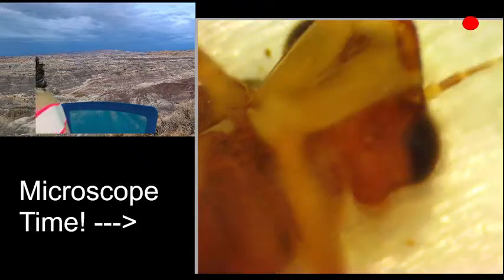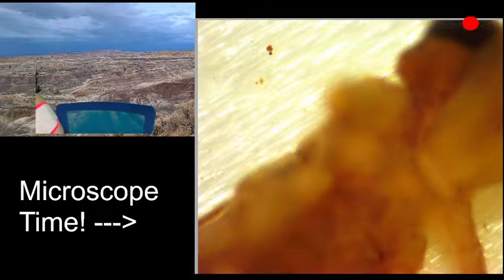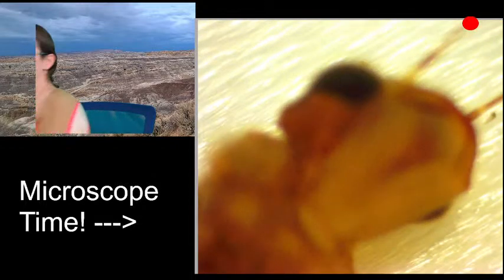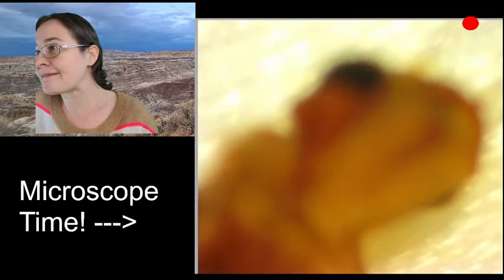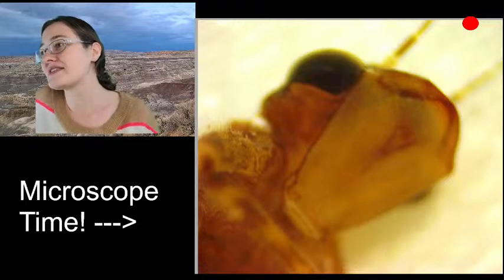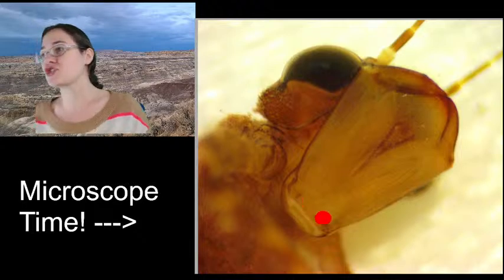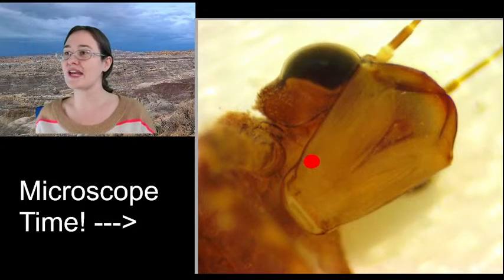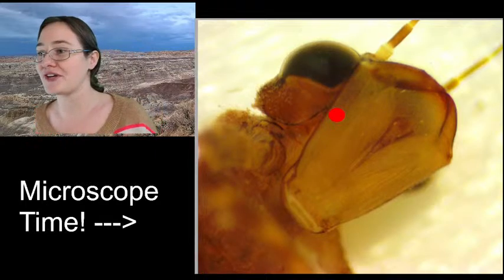Alright, my specimen is not going to be nice because I don't want to hurt it, and it's acting a little bit solid. So instead of hurting the specimen, we've got it a little bit on its side. This is the joint right here, and the joint then comes all the way back up. So instead of hurting the specimen, I will draw it for you.